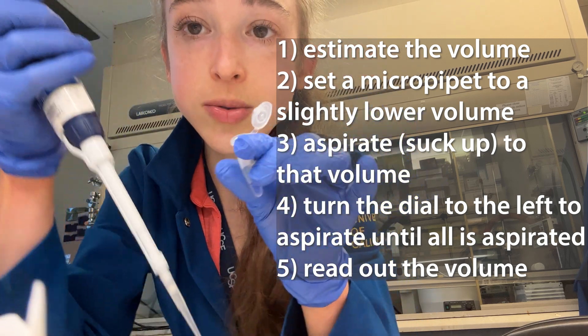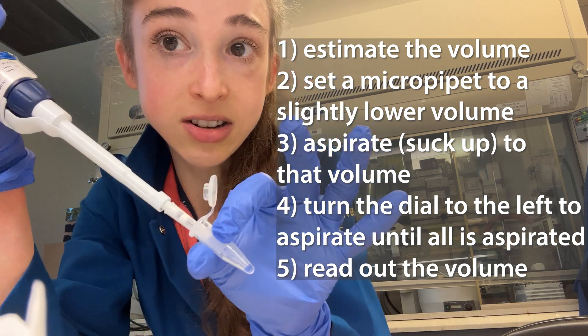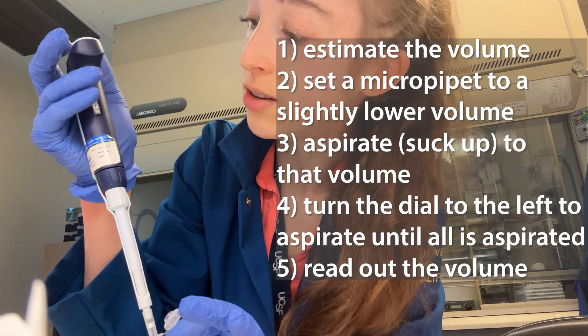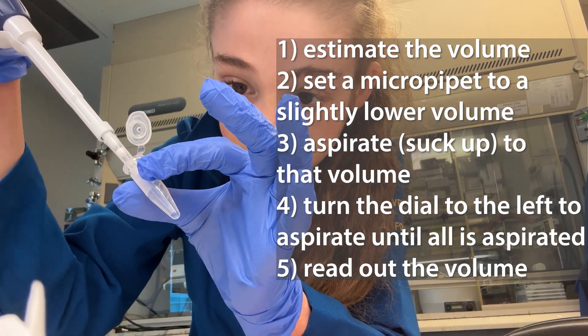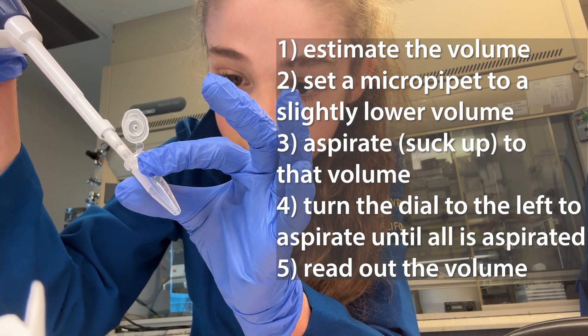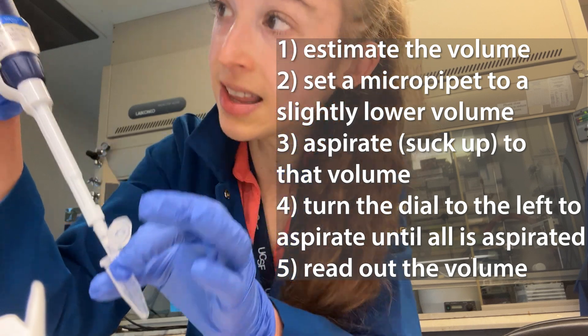Now I'm going to aspirate that 90 microliters — and you can see there's still liquid left in the tube. I'll start turning the dial to the left, sucking up the liquid until the last drop is right at the bottom. I don't want to suck up any air; I want the last drop of liquid to be right at the bottom, kind of like that.